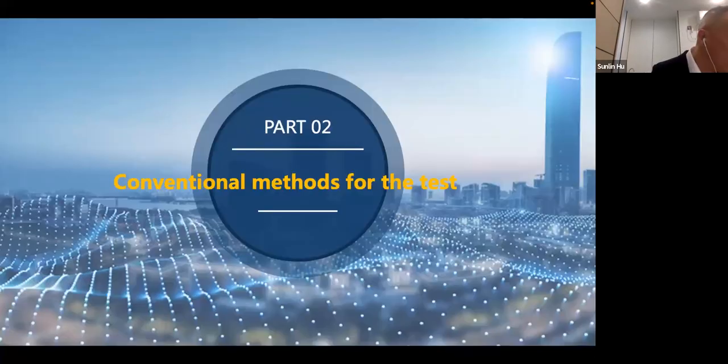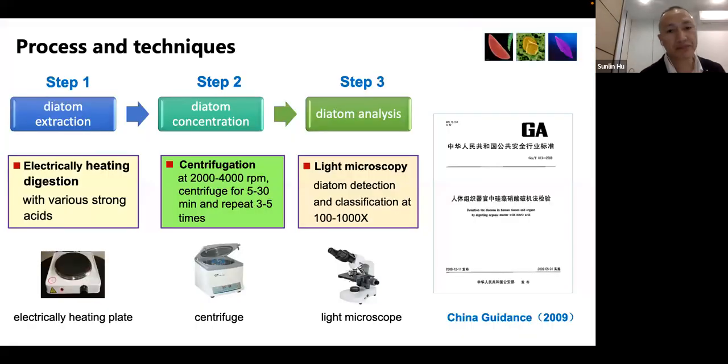Now, in part 2, I will describe how the diatom test is performed conventionally. The whole process can be divided into 3 main steps.